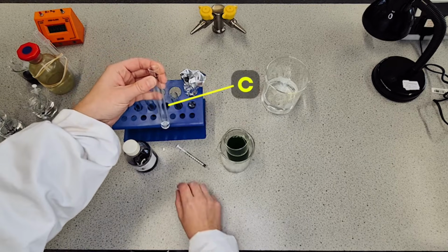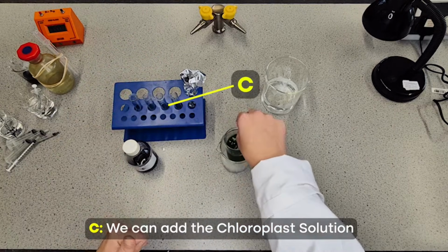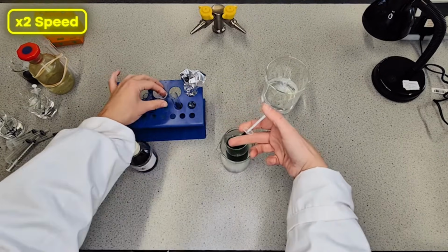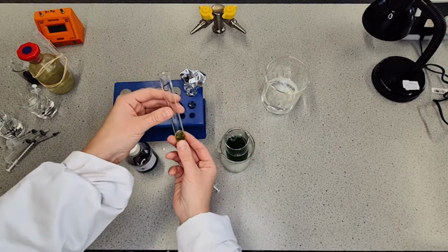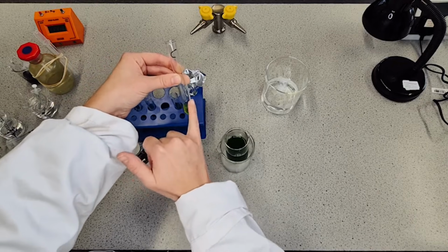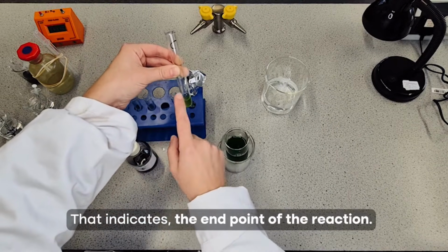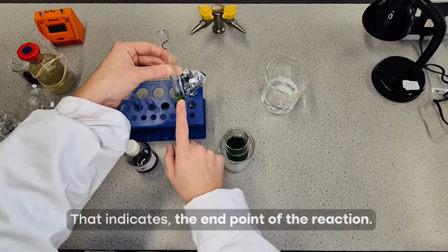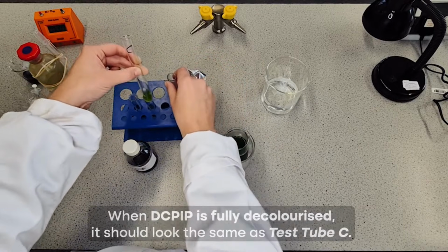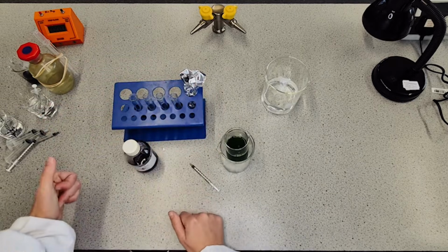Test tube C. Now this one I can actually add the chloroplast solution in now because this is going to be our color standard. There's not going to be any reactions happening here. So the point of test tube C is for us to compare all of the other test tubes to, and when they become the same color as test tube C, that indicates the end point of the reaction, because this is what the color of the chloroplast suspension is by itself. So when the DCPIP is fully decolorized, it should look the same as test tube C. So that's the purpose of C, to help us standardize these qualitative endpoints of the experiment.